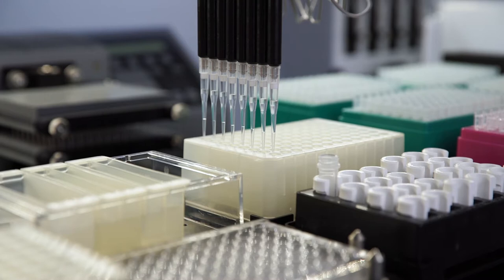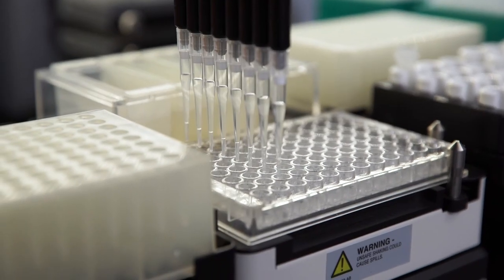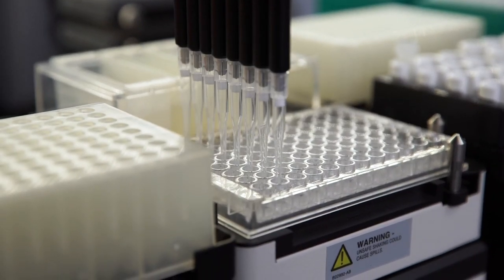Worried about sample-to-sample contamination? SPAN 8 liquid displacement pipetting enables flow through washing of pipetting lines.